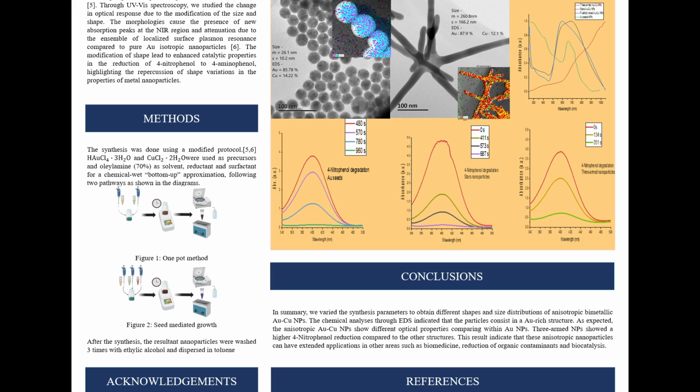Here we use chloroauric acid and copper chloride as precursors, and oleylamine as solvent, reductant, and surfactant.